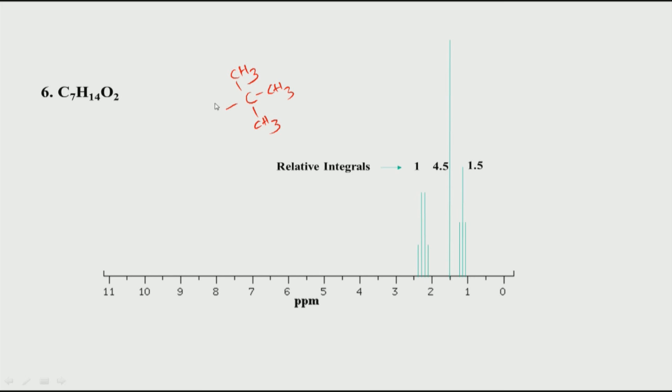The nearest hydrogen could be somewhere here, but that is very far away. Therefore, these 3 methyls are chemically equivalent, and they are not coupled to any hydrogen. So, you expect to get a singlet corresponding to 9. Why 9? Because we have multiplied this by 2 to get 2, 9, 3. So, this is one answer for the origin of this peak.